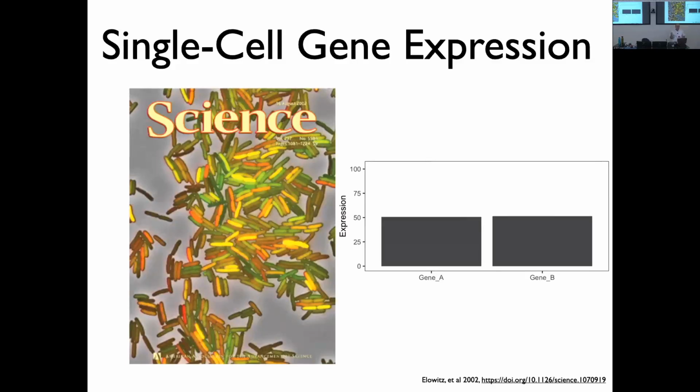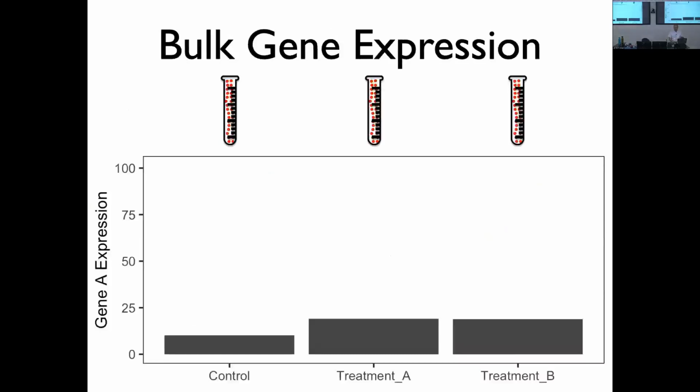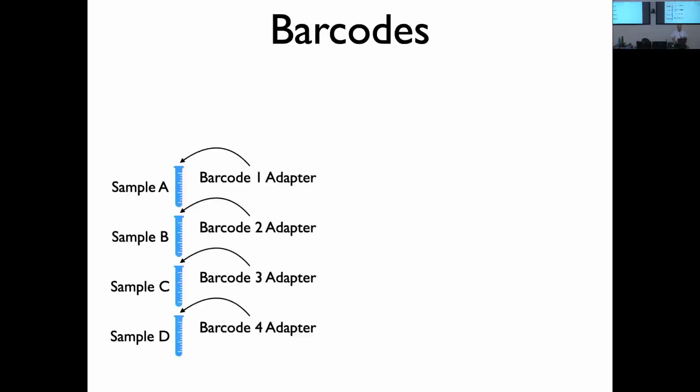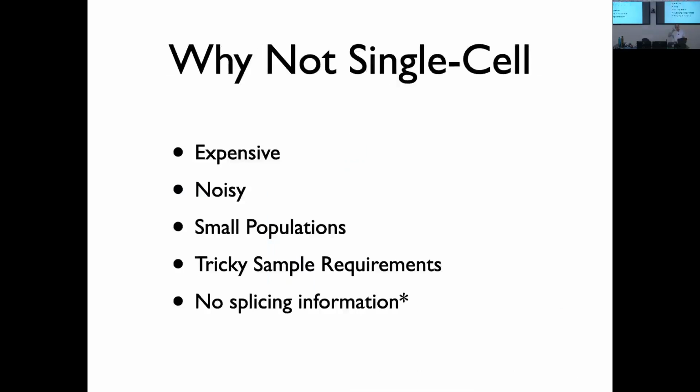even within the same cell type, you get noise. And whereas there's a concept of, say, housekeeping genes, or to go back to the example of T cell receptors, you think, okay, it's a mature T cell, it has a T cell receptor, so I should be able to see the T cell receptor gene. Now, you actually can't always see the T cell receptor gene in a given T cell, because, one, the expression of proteins can be noisy, and two, for some proteins the protein might be very stable, and so at a given point in time, the cell might not be expressing the RNA for that protein. So you get that biological noise.